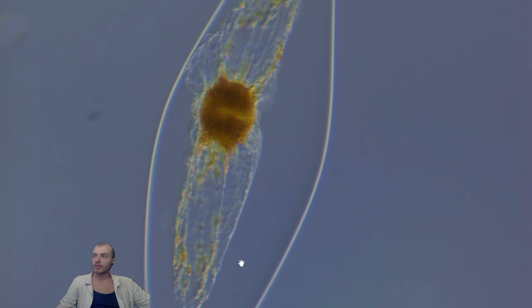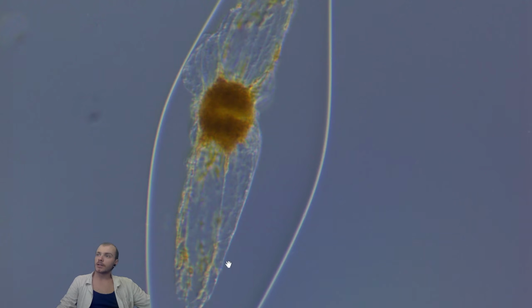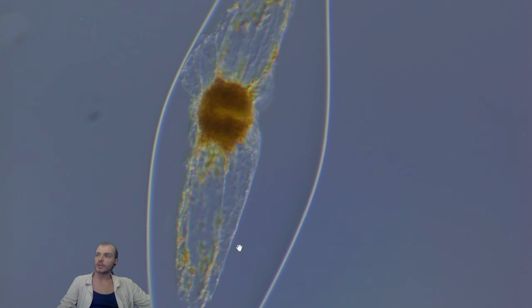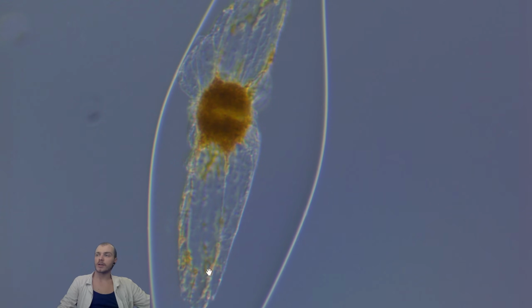But it is not normal for Pyrocystis fusiformis to look like this. It looks more like this is attached to the cell wall, this wall structure, but only the chloroplasts are contracted here, pulled towards the nucleus.